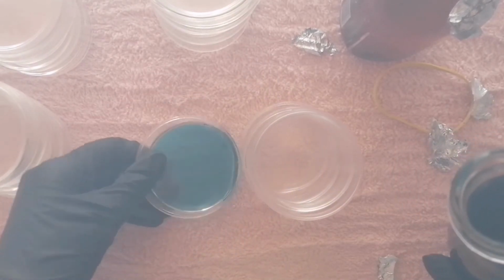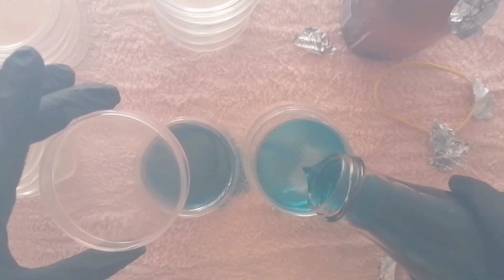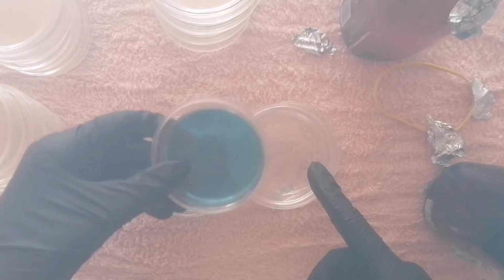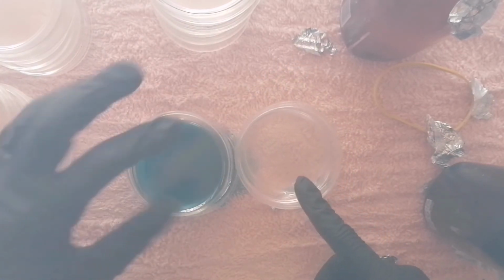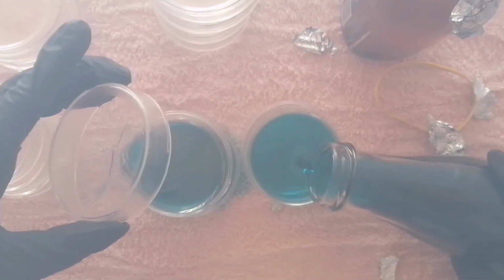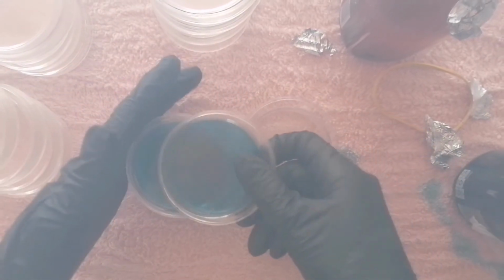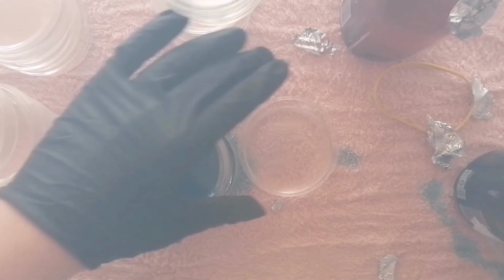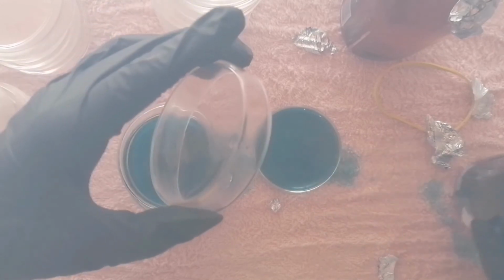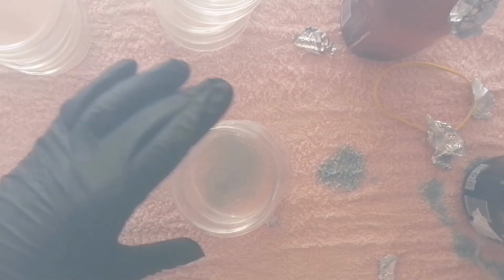So this is a mistake. I try to move it. As you can see, I messed. Don't do this. So I try it again. There we go. And I try to move it a little bit more gently. It did work, but it still messes everywhere. So then I try the other method that I forgot, which is the best method to use. So that's when you take the bottom lid. Oh, still not. Still making mistakes here. Okay. Anyways, let's do the last one. As you can see, I am messing. Luckily, this all did wash out eventually. Do not leave the food coloring for too long.